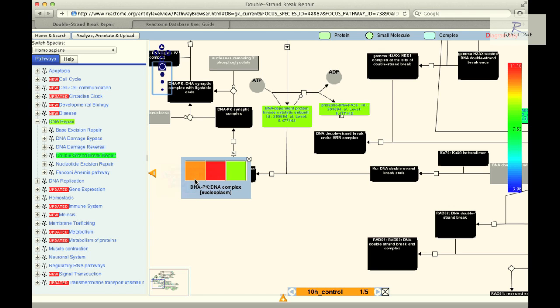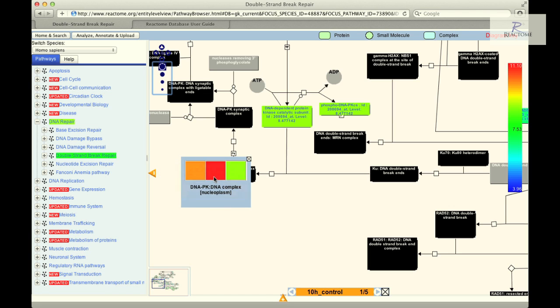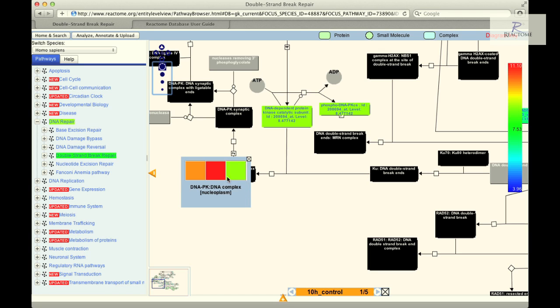Mousing over the colored boxes of the DNA-PK-DNA complex will display the names of the individual protein components of the complex, the expression values, and the Affymetrix probe identifier.